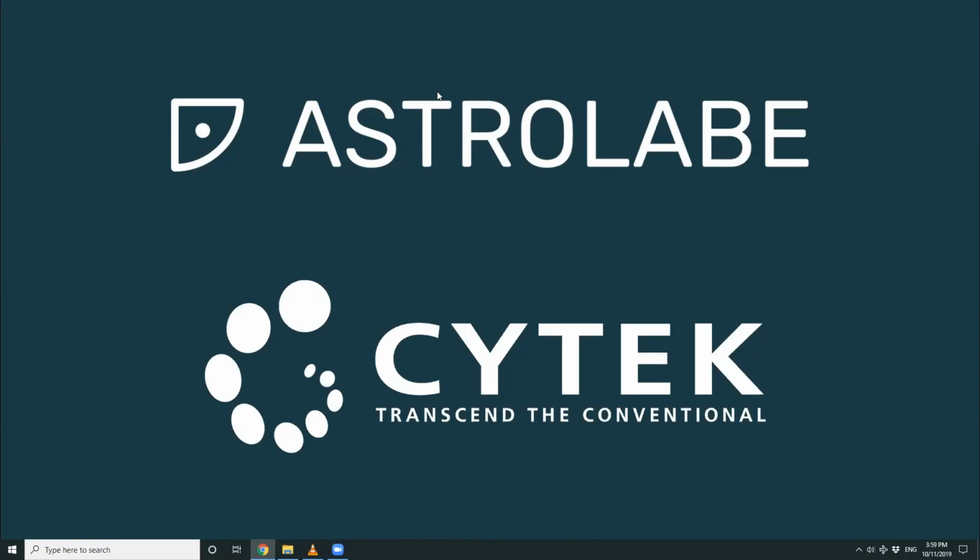So great question. For 3 laser configurations, the higher number of fluorochromes that we have effectively used together, and when I say effectively, is, as Janelle explained, without compromising the resolution. I think that has been something that we at Cytek have been very clear.